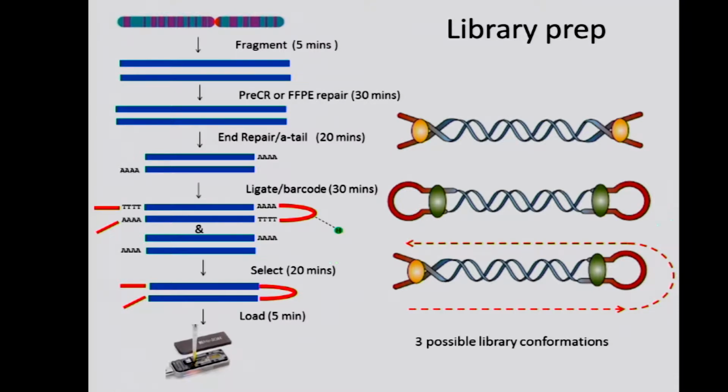However, because it's a ligation with all the adapters mixed together, we have this hairpin and this leader structure that's also present. The other important thing to note that makes this a more touchy step is there are some proteins pre-ligated in different positions, depending on which chemistry you're using, onto those adapters. So you have to use some of their fairly specific low protein binding tubes or special elution buffer. Treat it very nicely to make sure you get as much of those properly formed libraries as possible.